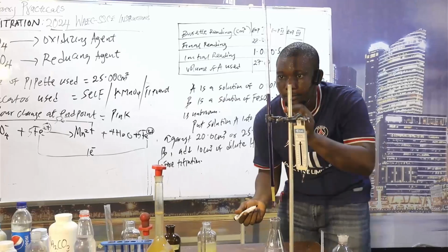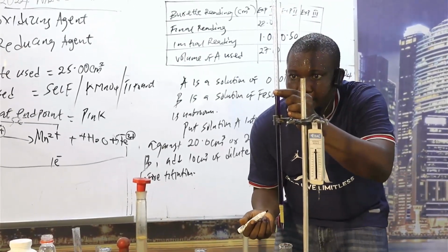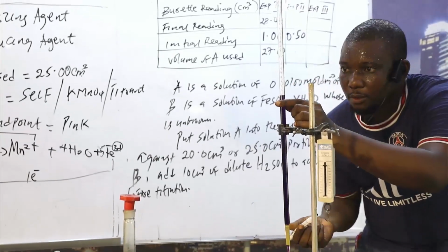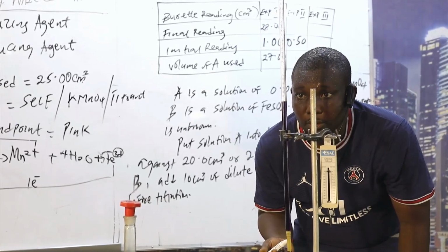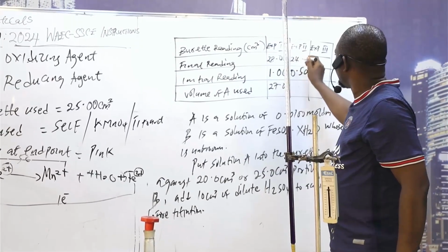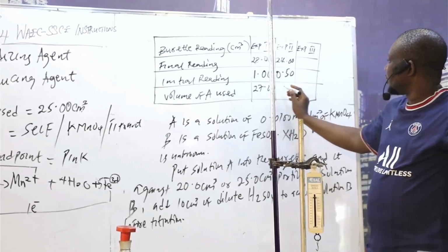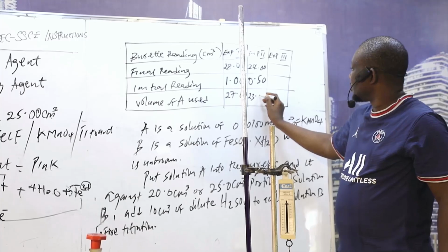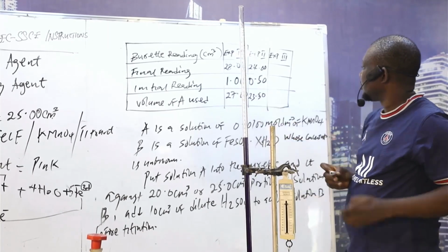Okay. So the first one we did is actually going to be our rough, because, okay, this is exactly 24. So I have this as 24.00. So what do you have here? What do you have here now? 23 point what? Point what? 5 what? 0. Okay.